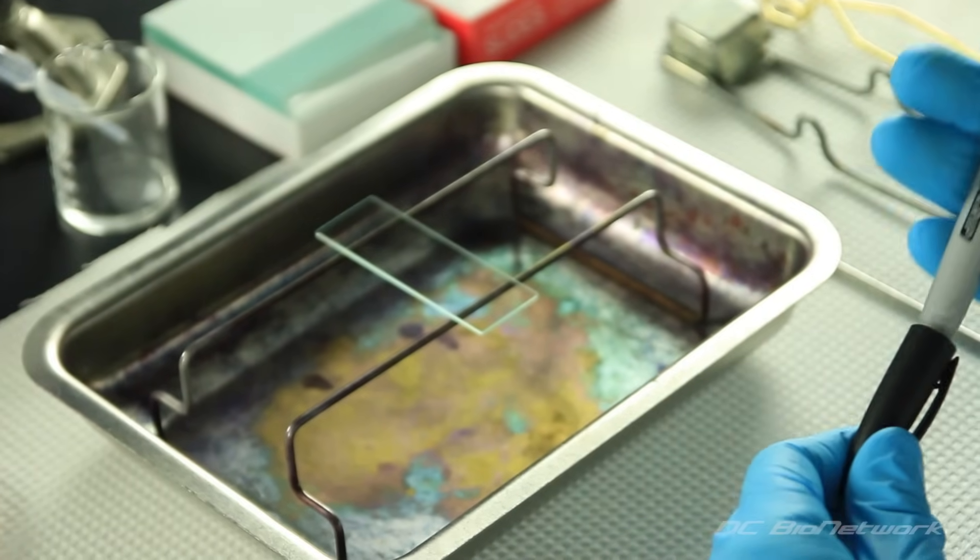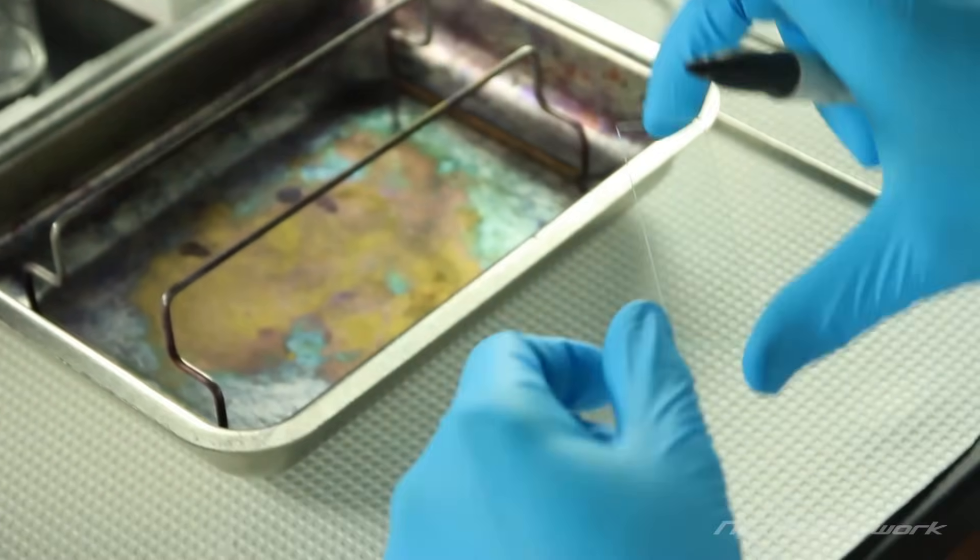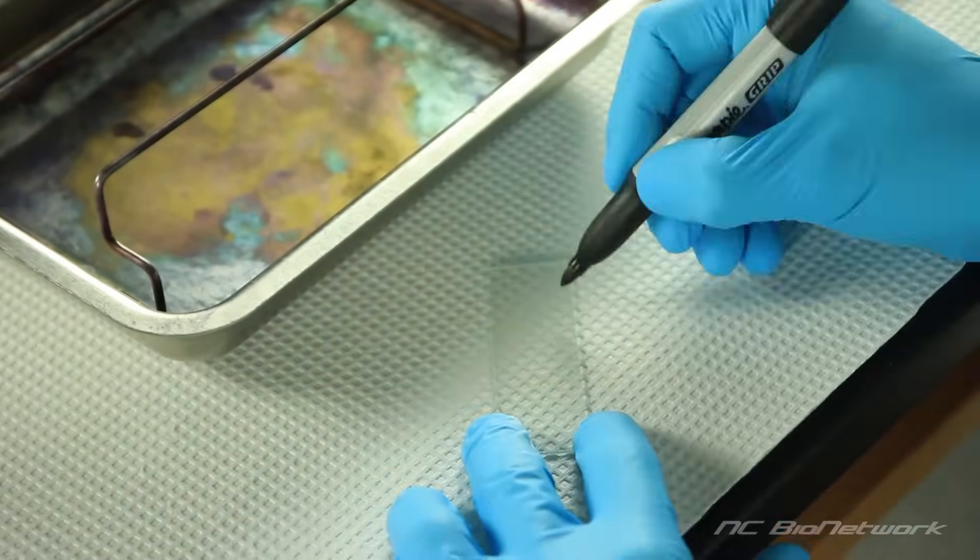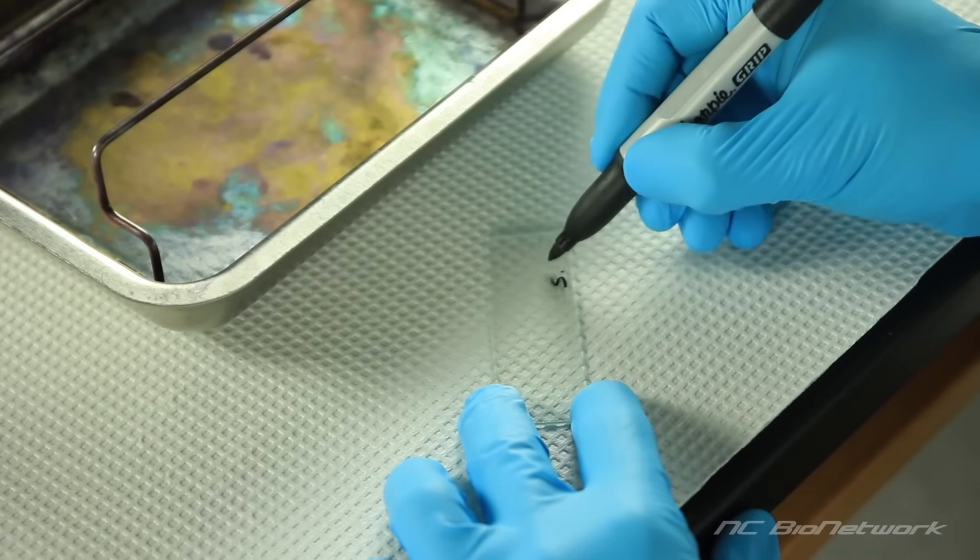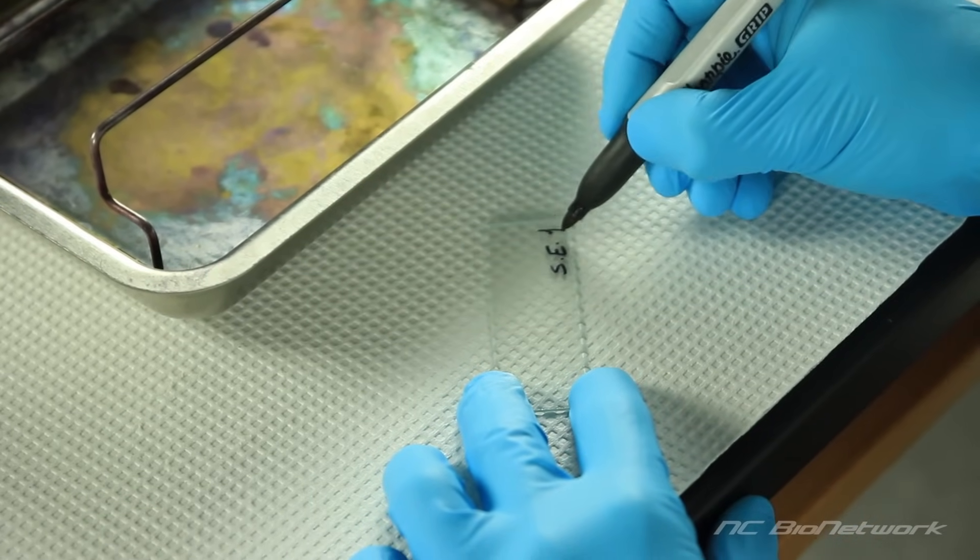Start with a clean microscope slide. Use a china marking pencil to label one end of the slide with the specimen name. Draw a circle in the center of the slide.